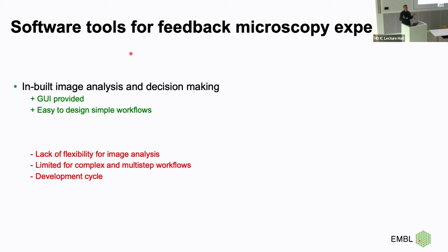What we find in terms of a facility and in terms of complex projects and growing demand is that sometimes we have a lack of flexibility for image analysis. Not always can we support multi-step protocols where I want to go low zoom image, medium zoom, high zoom image, and so on and so forth. And then, of course, we have to respect the development cycle of the company. If we have a demanding application, we have good collaborations with the companies. You ask, is it possible to do? Yes, but it will probably be coming. But if I have a PhD student who needs to finish in a couple of months sitting next to me, transferring this message to this PhD student is probably not the most appreciated task.